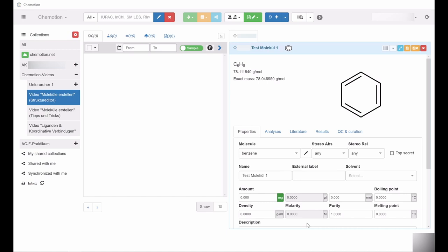It should be noted that either the density or the molar concentration can be entered, but not both. For pure substances, the density should be recorded. For substances in solution, the molar concentration should be entered. Double-clicking the unit behind the respective property allows you to switch the input field between density and molar concentration.